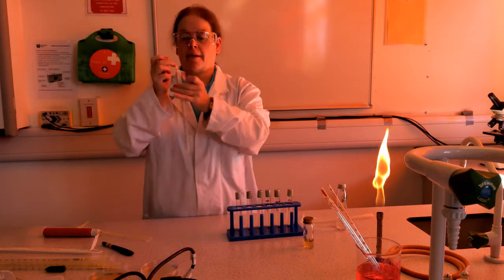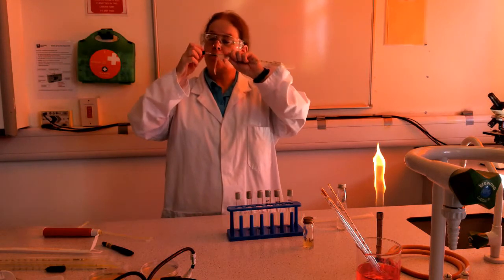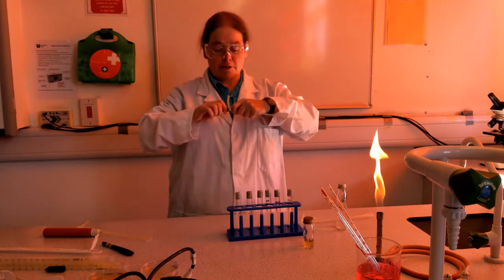I think that's one of the reasons they put cotton wool in them. I'm sure there's a better reason, but it doesn't help me to work out which is the right end.